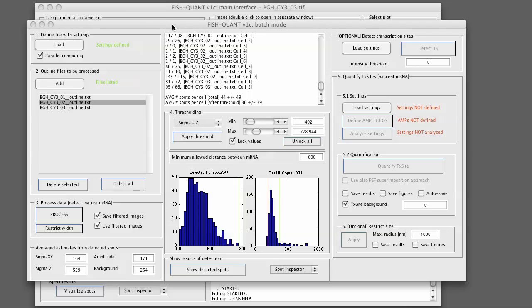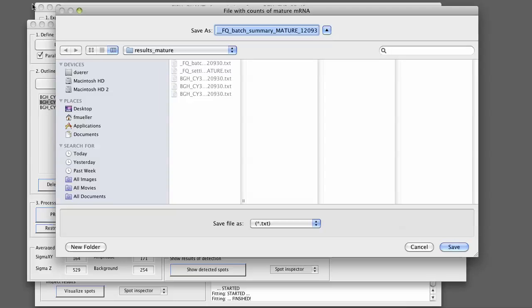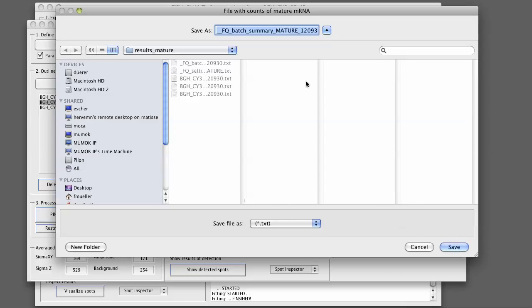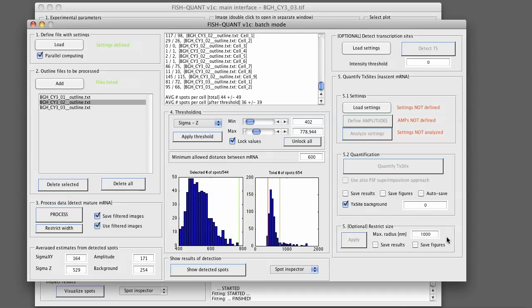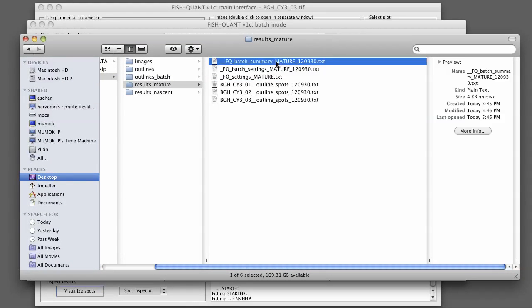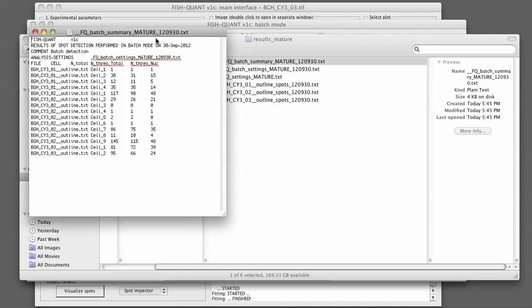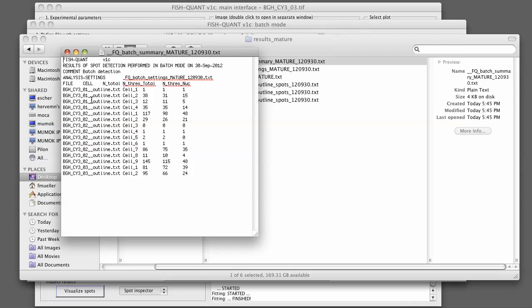Last but not least, we can save summary mature mRNA, again in the results folder. This contains a summary of the mature mRNA quantification. For each of the cells, we have the total number of detected spots before and after thresholding. In the last column, we have the number of spots that are within the nucleus if the nucleus was detected.